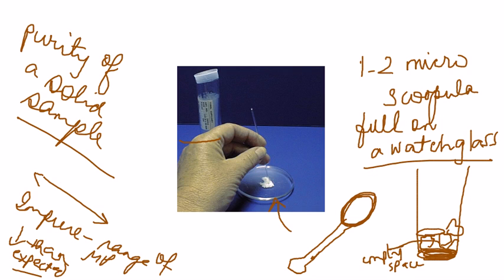Since it's not uniformly packed, the heating is going to be non-uniform, and the air in between is going to expand while the heating takes place. So you will see some bubbling and some strange observations which you otherwise are not supposed to see. When you keep this completely powdered, you minimize all of that. You have very tiny particles which stack upon each other very well, the same way they place oranges or apples in the produce section.